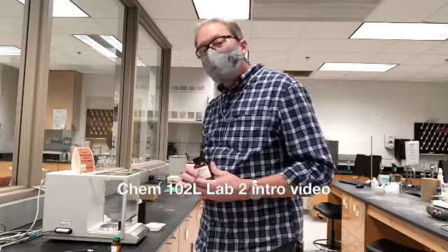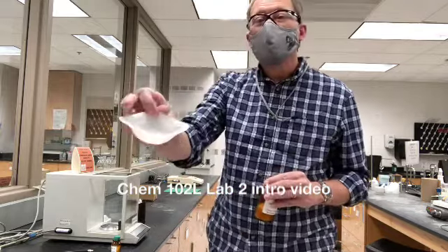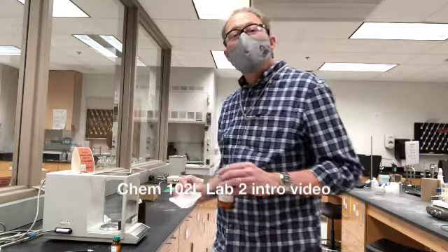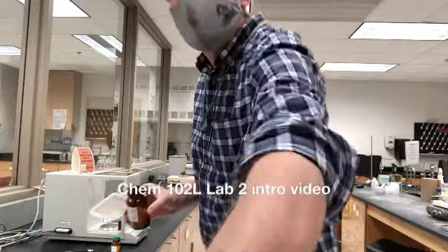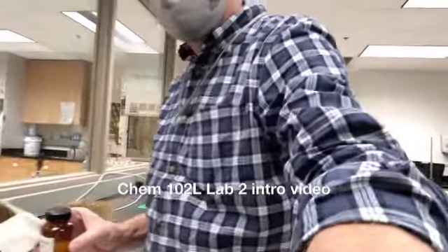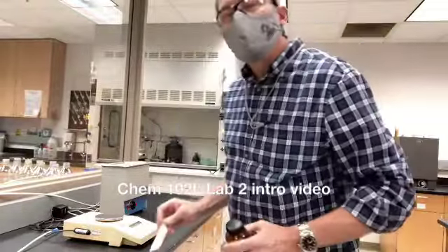So a really very easy way to do that is to take a weighing boat. It's this little flexible plastic weighing boat. I'm going to take it over to this top loader balance, and maybe I'll take you along over there. And we want about 4 grams.